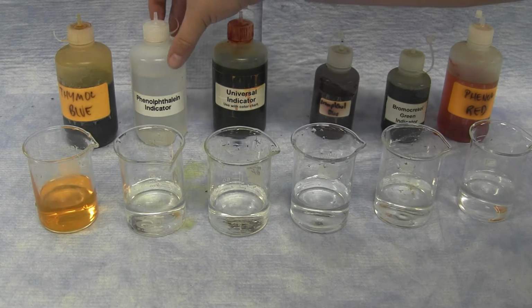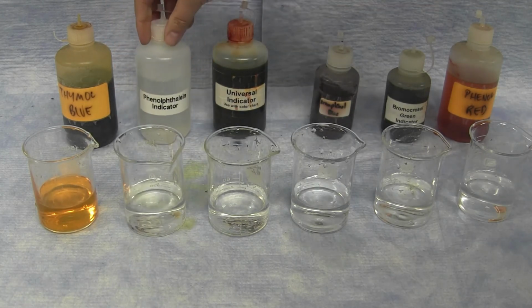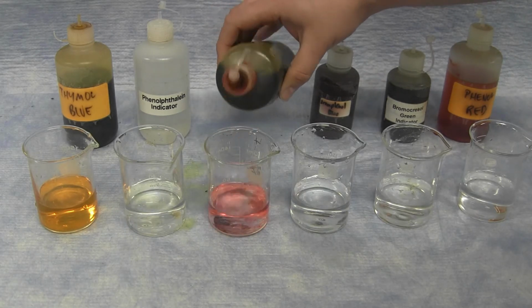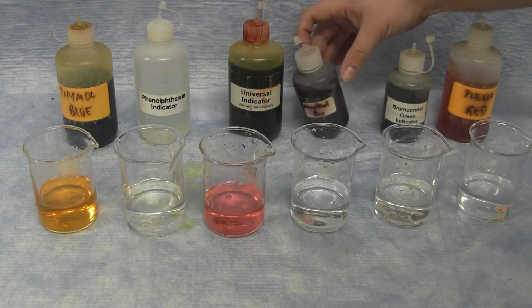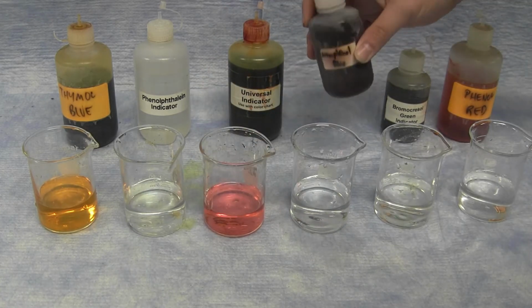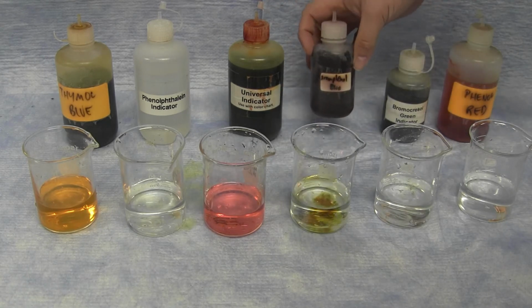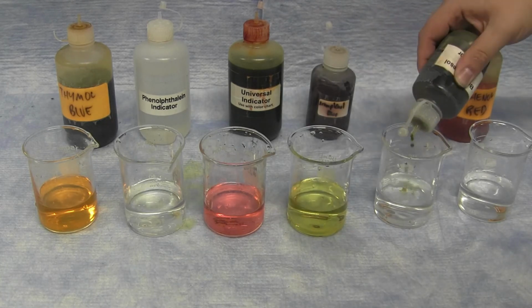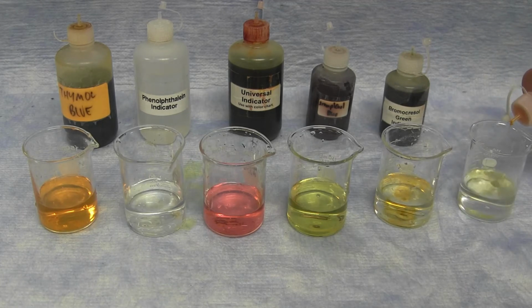Using these different indicators, you can see which ones have a color under these specific conditions: thymol blue, phenolphthalein, universal indicator, bromophenol blue, bromocresol green, and phenol red.